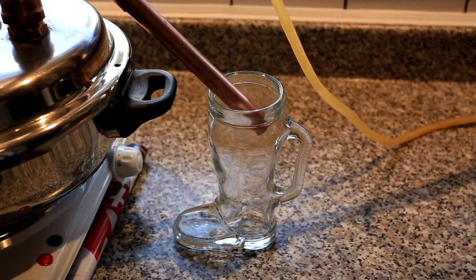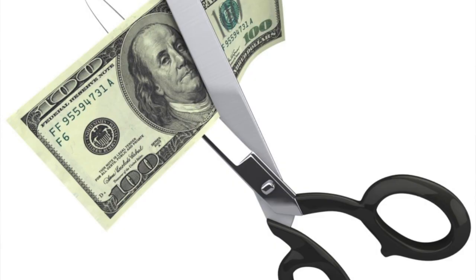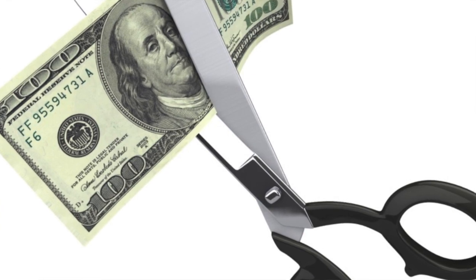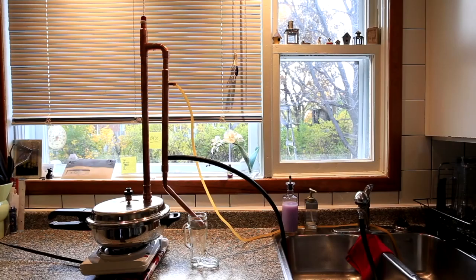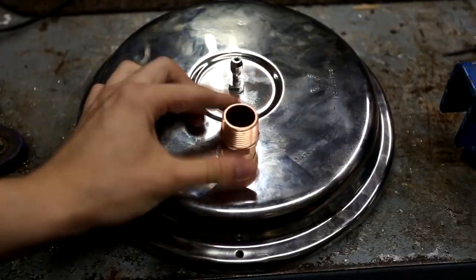Suppose you want to distill small amounts of alcohol or other common solvents and you want to be able to do it on the cheap. The first problem you'll need to solve is what to use as your boiling flask. Most homemade stills, like this one built by YouTuber Niall Red, use a modified pressure cooker, which works great, but they're expensive and they make for a complicated build.